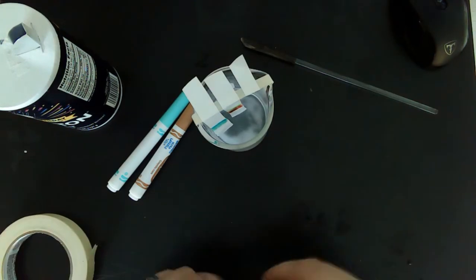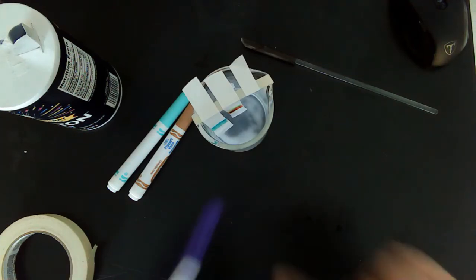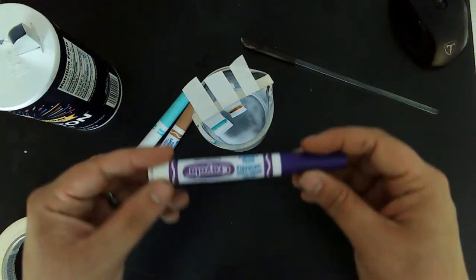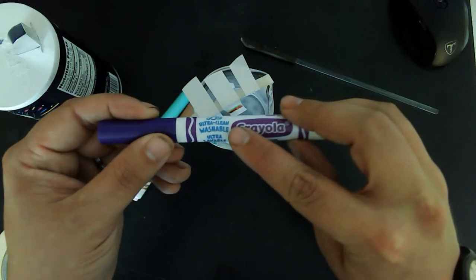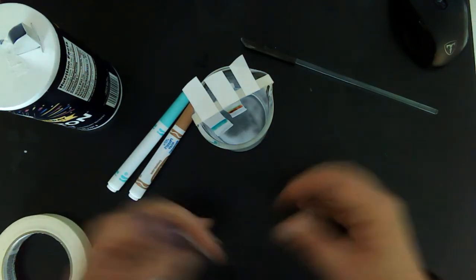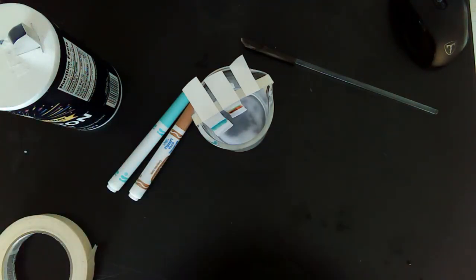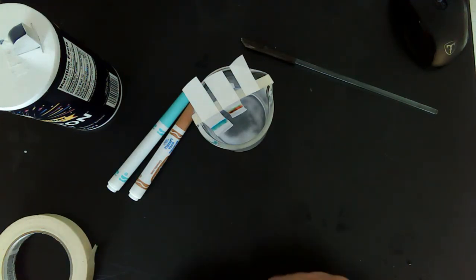Okay, so what is going on exactly? This is about solubility, and that's the whole purpose of chromatography: looking at whether substances are dissolvable in a liquid. Since we used these ultra clean washable markers, they are absolutely dissolvable in water and even more dissolvable in salt water. As these pigments soak up in the water, they're soluble, they dissolve, and they travel up the paper. We're going to hit pause on this video, and in about 15 minutes we'll see these nice and dried. We'll talk about them, and then you can finish up your lab procedures and post-lab questions at home.